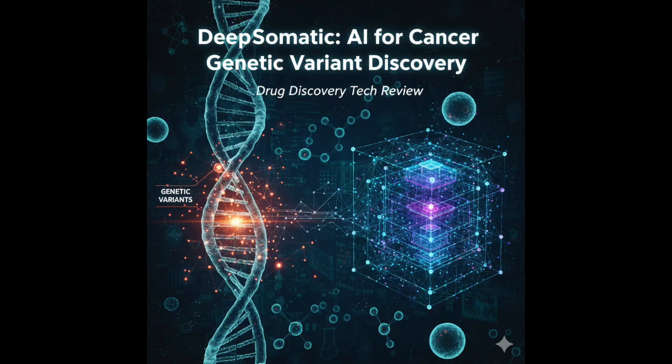No, and this was key to creating the high-confidence truth set. They performed whole genome sequencing, WGS, on all 5 cell line pairs using 3 major sequencing technologies simultaneously. Which ones? Illumina, the standard for short-read sequencing. PacBio Hi-Fi, known for its highly accurate long reads. And Oxford Nanopore Technologies, or ONT, famous for very long reads, even if the per-base accuracy is traditionally a bit lower than Hi-Fi.